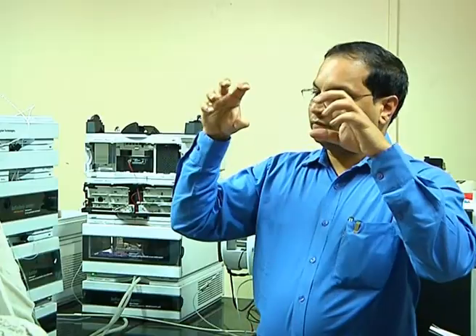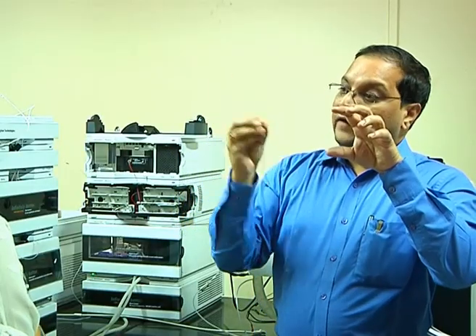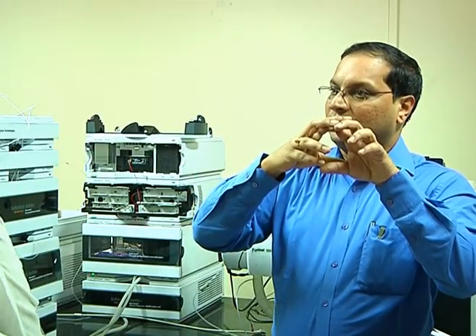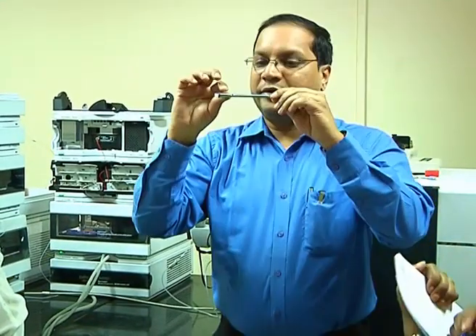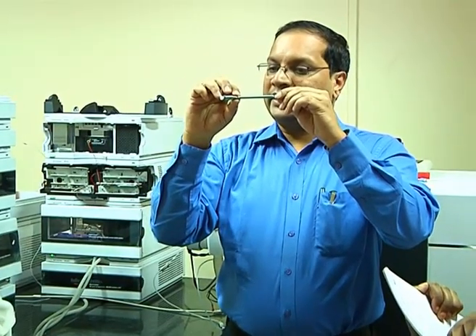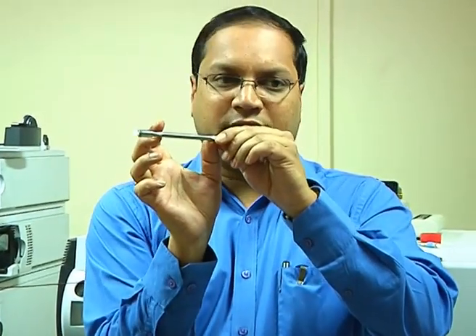Broadly, the pumps will pump the mobile phase, where A is water, let us say. While loading the sample, we use more of the aqueous phase so that your peptides get retained on the column, the stationary phase. Depending upon hydrophobicity, of the 10,000 peptides, a few will bind here, a few will bind there, and they'll get spread across the column.